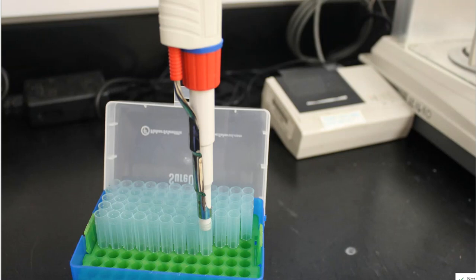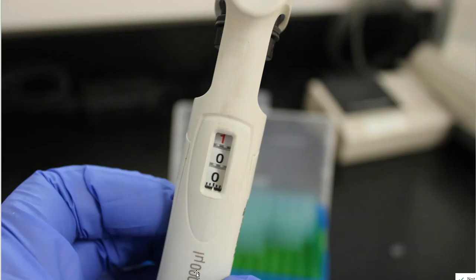You do not need to pull them out by hand. What are you doing? It's almost like they don't pay attention at all. They probably don't, but that's okay, whatever. The other thing is that they see 1,000 and they try to dial this up to 1,000. And then they come back to me and they say, well, wait a minute, this only goes to 100. I'm like, no, you just didn't pay attention to me again. It goes to 1,000, but there's only room for 3 numbers.